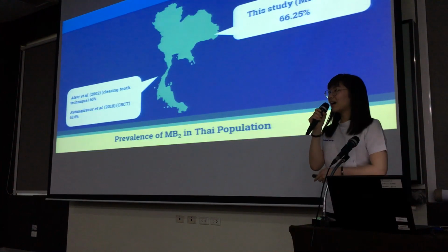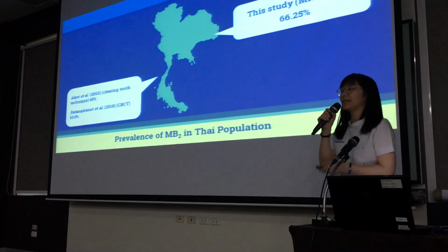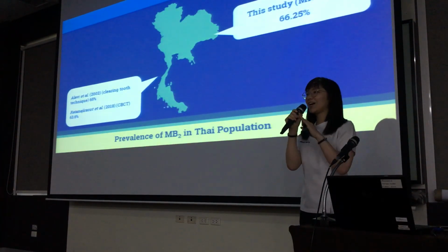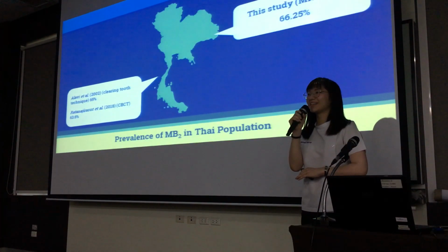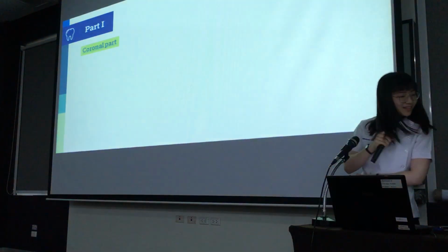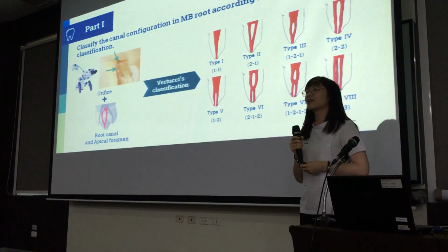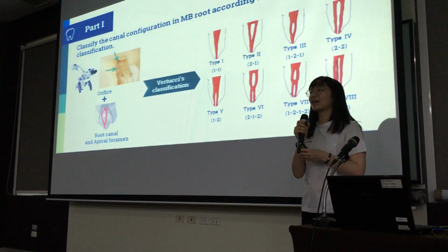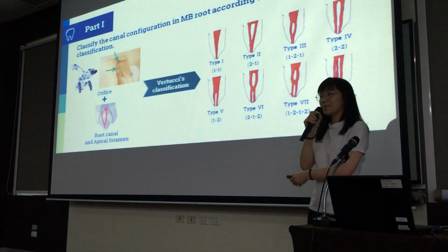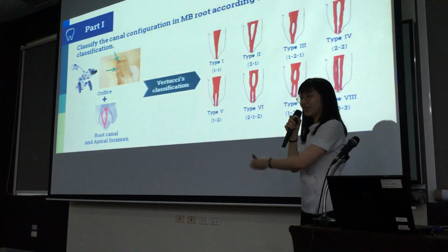Not completely flat. As I said in the methodology, we define the pulpal floor level by the first slice that had 3 orifices. So it doesn't correspond exactly to the pulpal floor in the clinical situation, but by MicroCT it cannot be defined like in clinical.